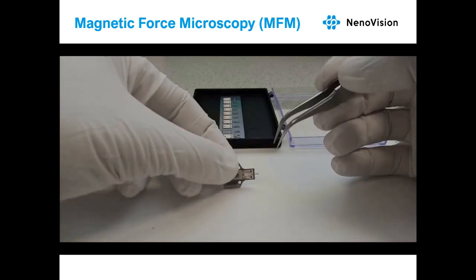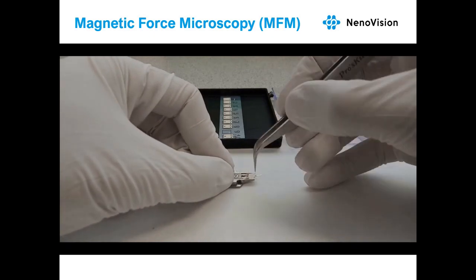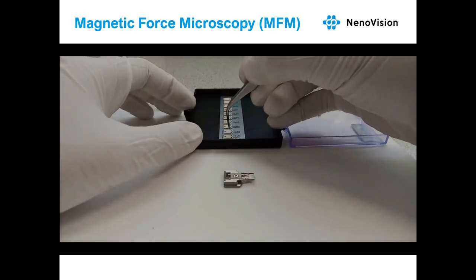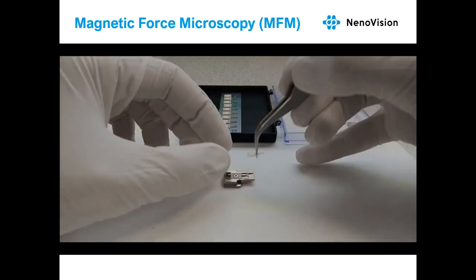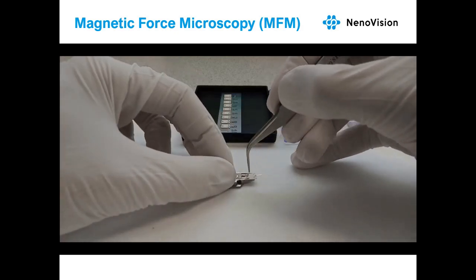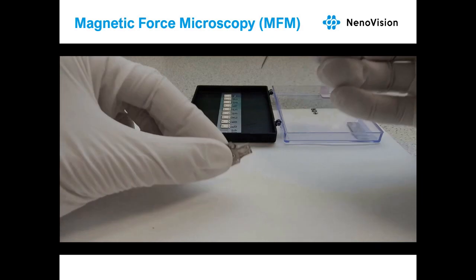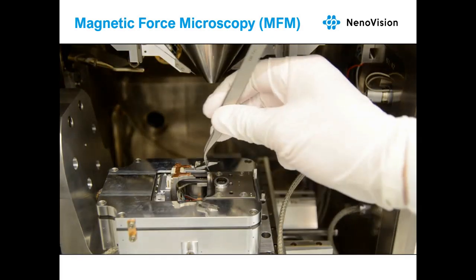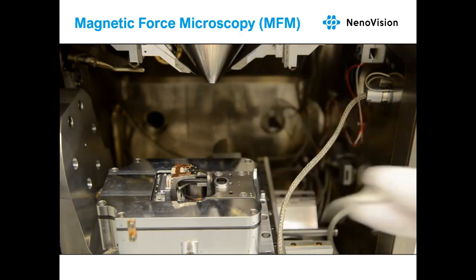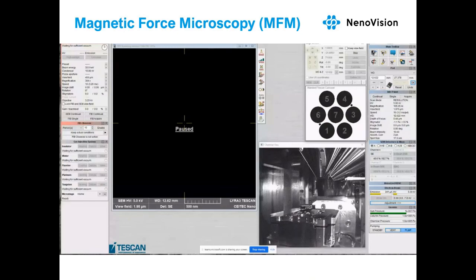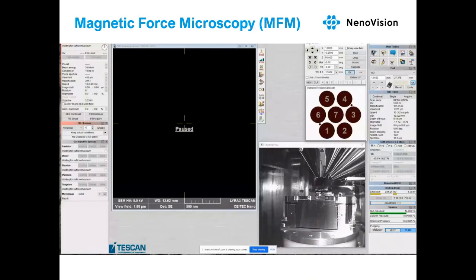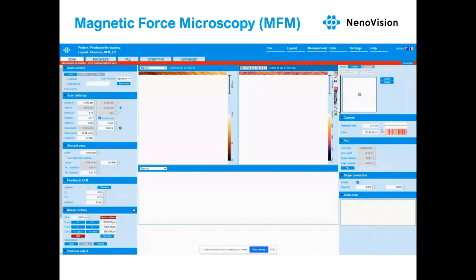At the very start we have to exchange the regular Akiyama probe for a NanoProbe Magnetic, which is an Akiyama probe with a magnetic nanowire at the end of the tip. That is the only difference — otherwise you insert it into the microscope as usual and then insert the whole microscope into the scanning electron microscope. In the NanoView software, the first thing is to find the resonance frequency of the probe.